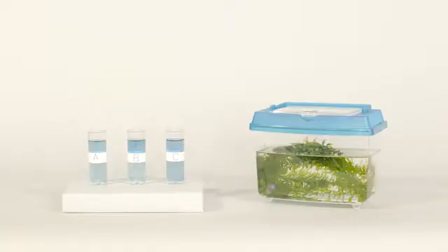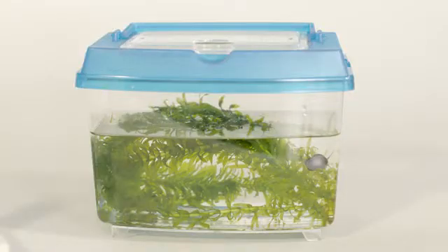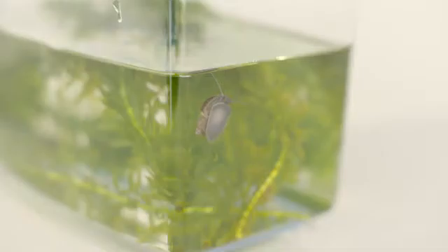In this experiment we see whether producers or consumers give off carbon dioxide. In the box we have a producer, the water plant called Elodia, and a consumer, the snail.